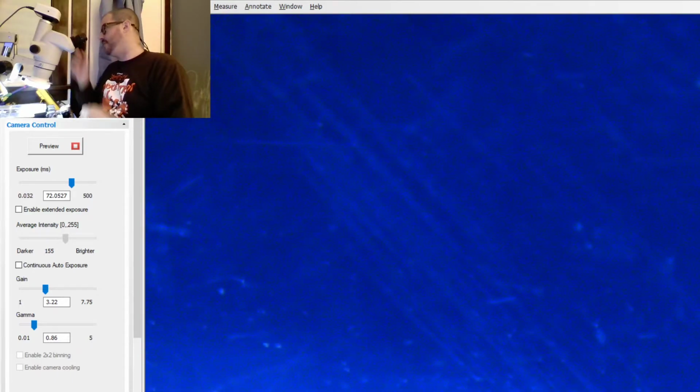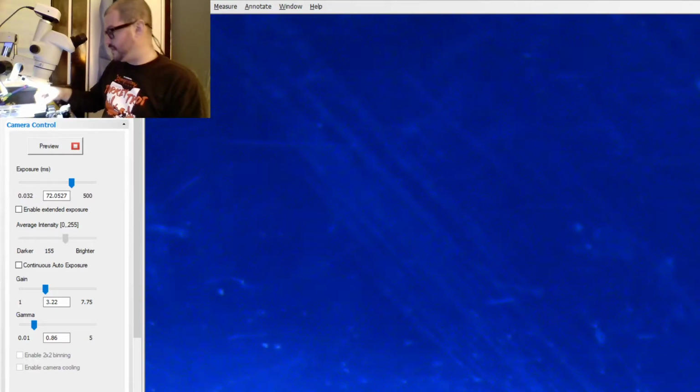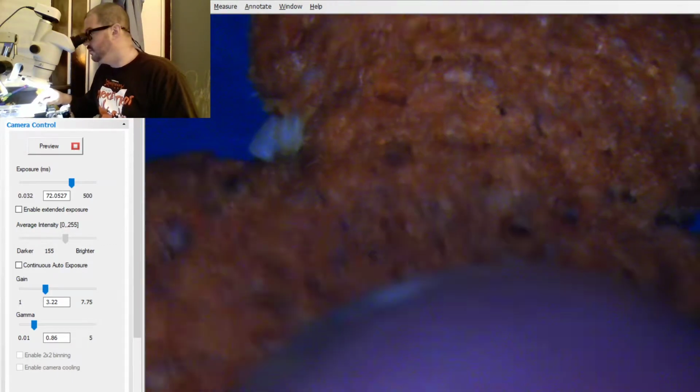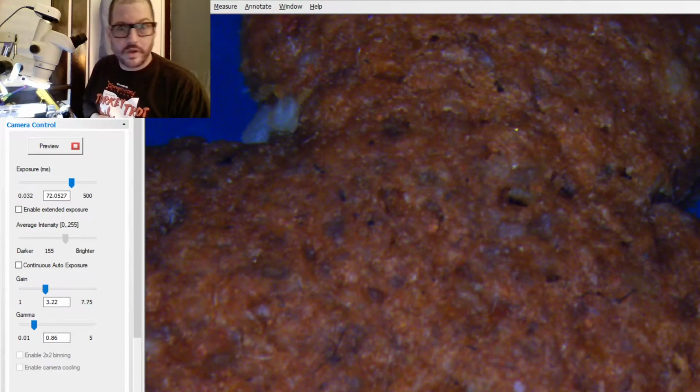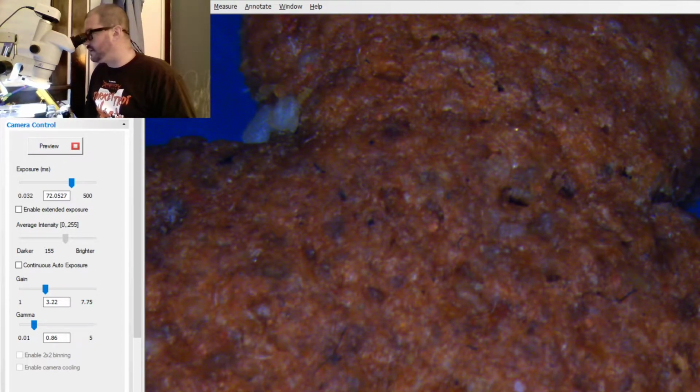I'm going to set the microscope right here for 6.7x magnification, which is my lowest set of magnification that I can actually go to here. And let's put it on my little stage here, and let's move it in. Whoa! Look at that. That is awkward looking. Whoa! It looks so grainy and like it looks so made of a million things.